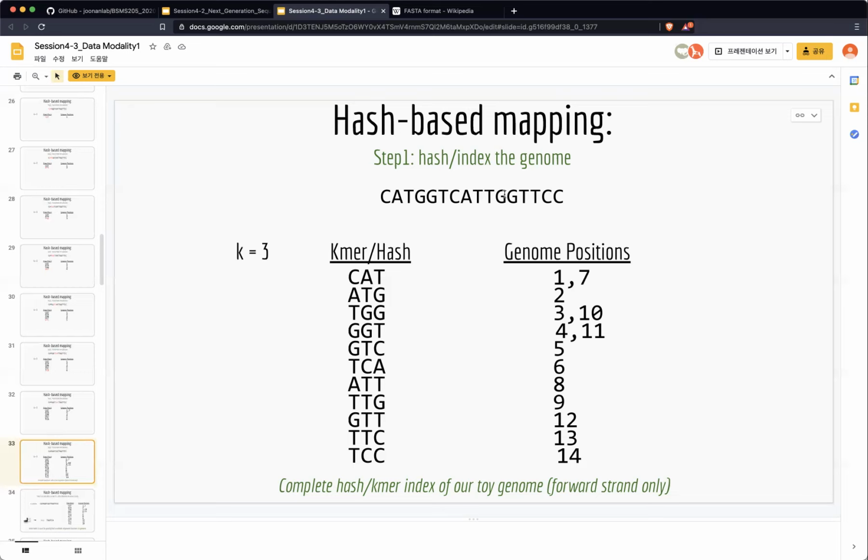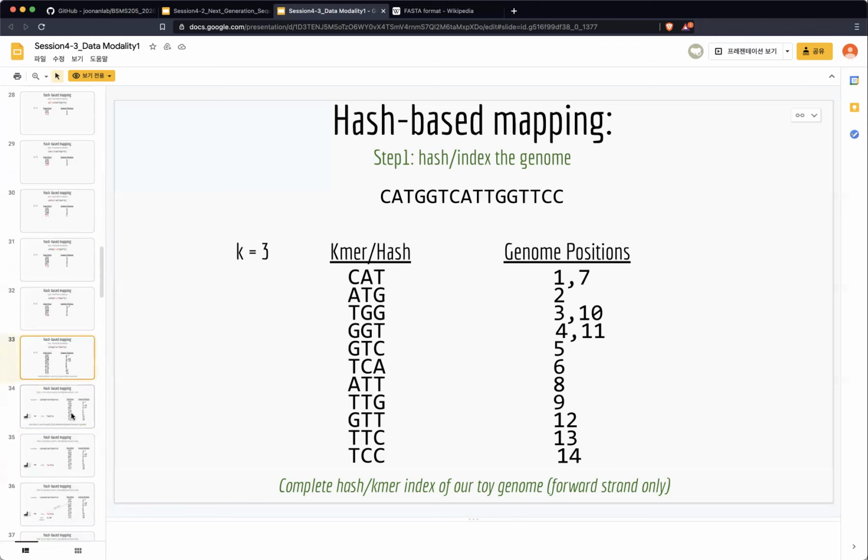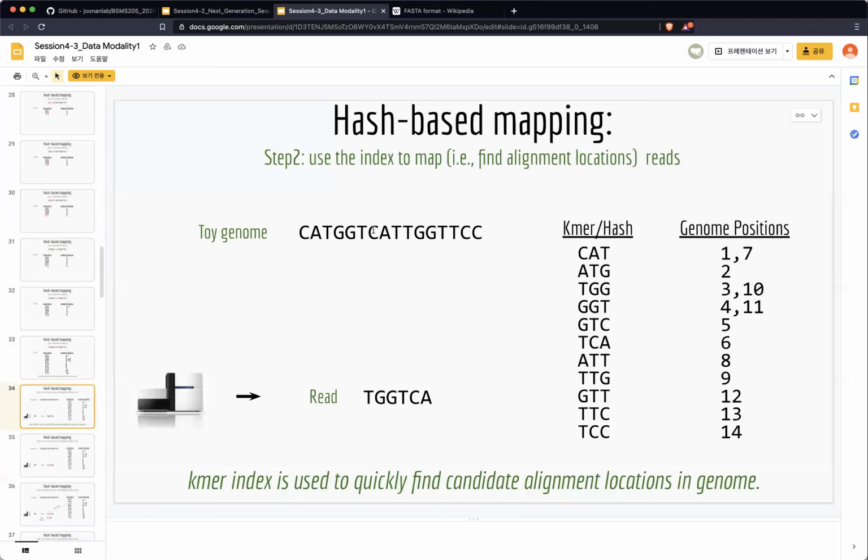Because that hashtag is working for that collections, right? So in this mapping situation, you can also use the hash information. Hash is one of the basic things you can think about in a computational field. So DNA alignment also uses the hash information. Then you can build up all of this index information into one. Then you can easily track down the information from this, right?